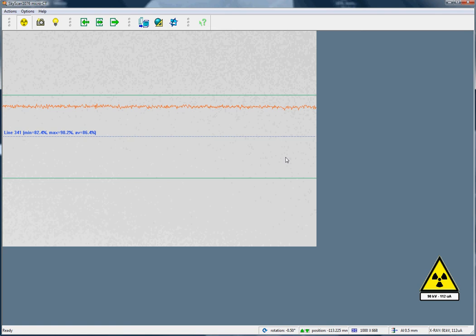What do we mean by scanning mode? Well, in all scanners there are combinations available of different resolution levels, different filters, and in some scanners different scanning geometries.